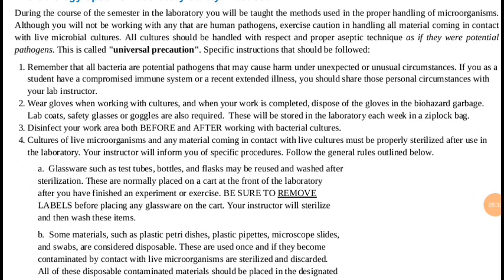If you as a student have a compromised immune system or a recent extended illness, you should share those personal circumstances with your lab instructor, because you may be exposed and then fall sick, and your immunity could be compromised.